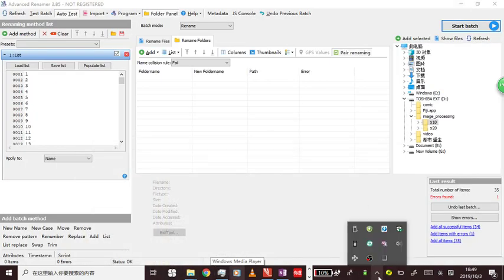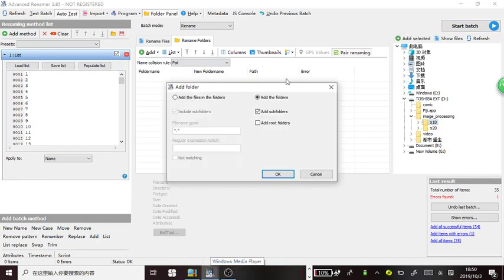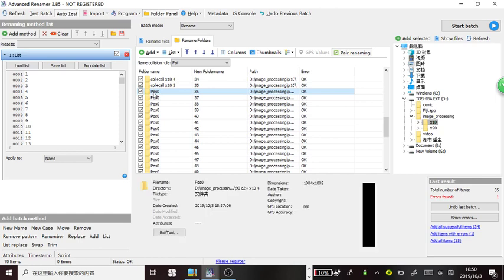And let's check, is the video still on? Yep, the video is still on. And let's load it again. Let's select it, add subfolders, sequence it with the name sequence, remove the tertiary subfolders.